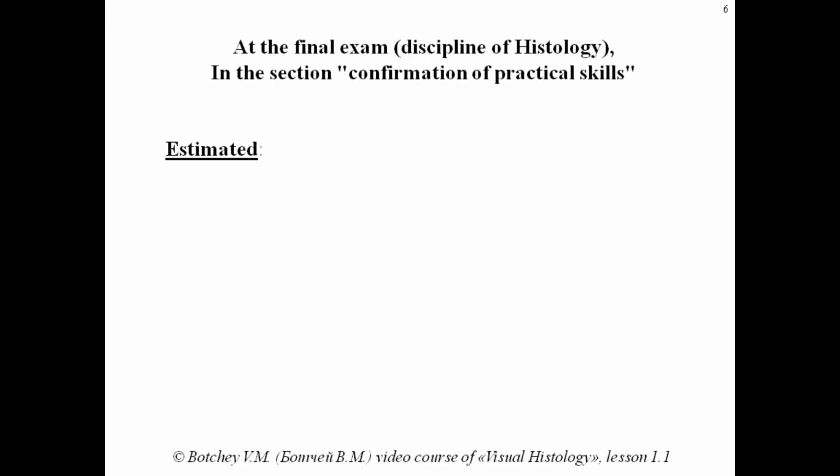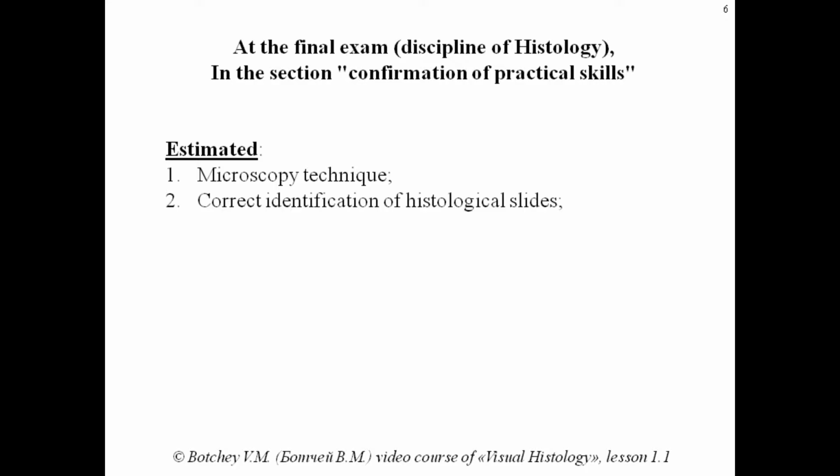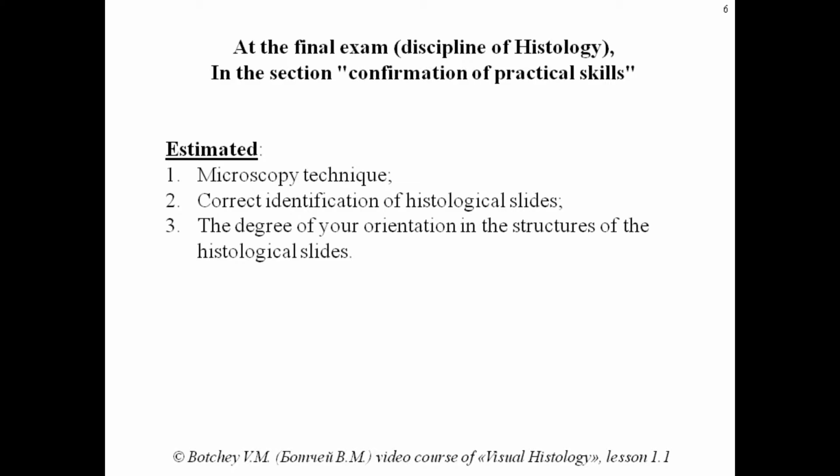At the final histology exam, you will demonstrate practical skills. The examiner evaluates the following parameters: microscopy technique, the correctness of your handling of the microscope and histoslides, correct identification of histoslide name and stain, and the degree of your orientation in the structures of the histoslides.